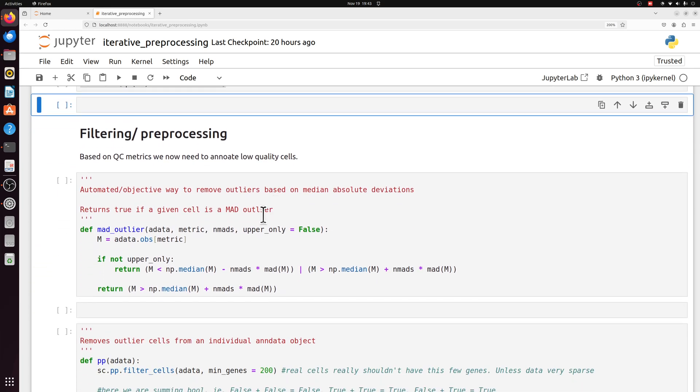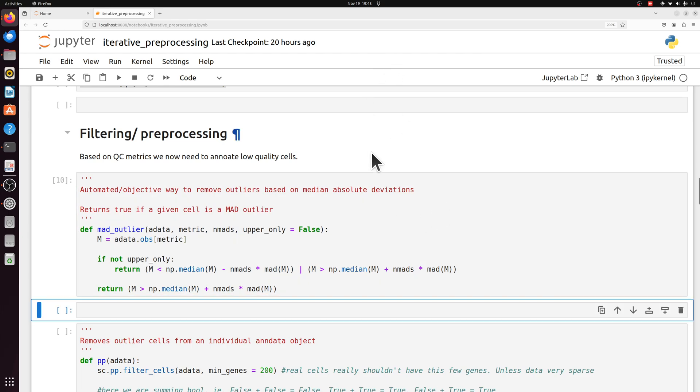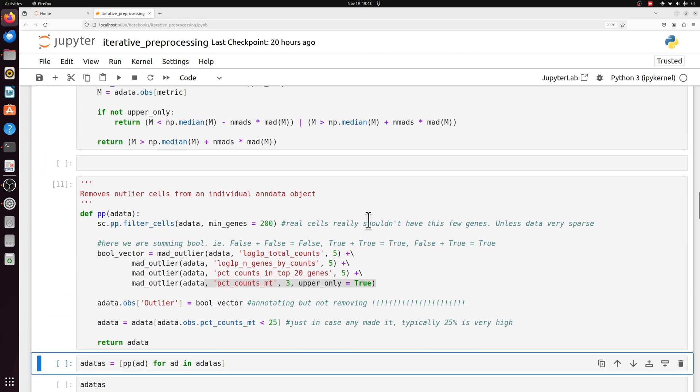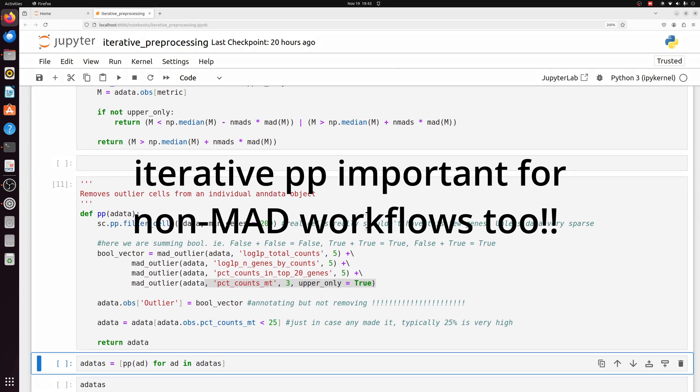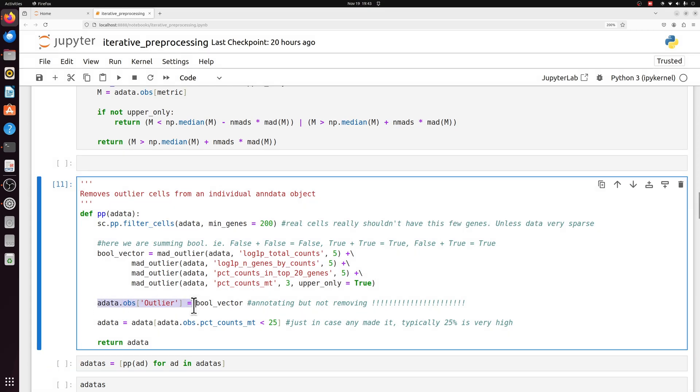We're going to annotate different QC variables, like the mitochondrial percent and all the other typical QC variables. So instead of filtering this time, we're going to do annotation. So we're going to label all the cells. I've talked about this MAD outlier business before, but instead of getting rid of them, we're making a new column in the observation data frame that's just true or false, whether it's an outlier or not.